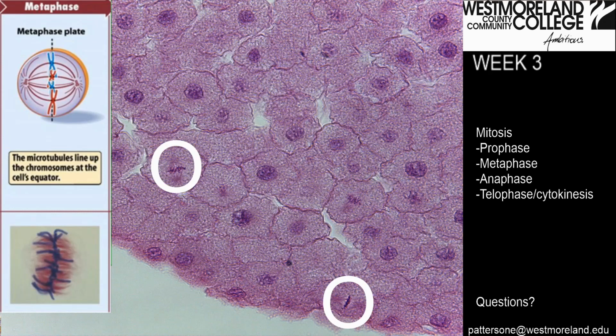We can see their central nuclear area. We can still see the little bit of a dark coloration, but it's not a circle. It's kind of a straight line across the middle, and these ones are oriented slightly different. Just to give you an idea of, this is a three-dimensional object.